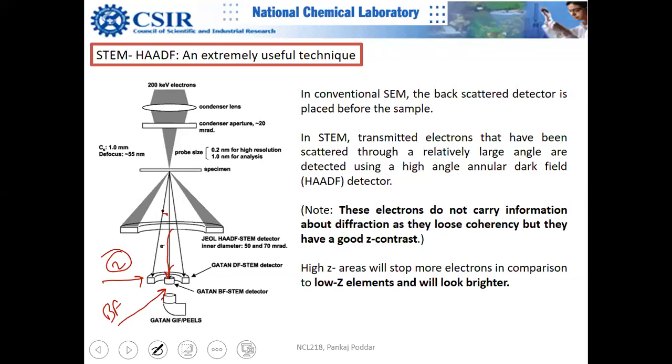Okay, and it's not easy actually, we will discuss this, because this detector can detect only at a certain theta, right? Only one diffraction angle, but you have many diffraction angles. So how can it detect at other diffraction angles? There is a trick, because you cannot make one detector for one angle and another detector for another angle.